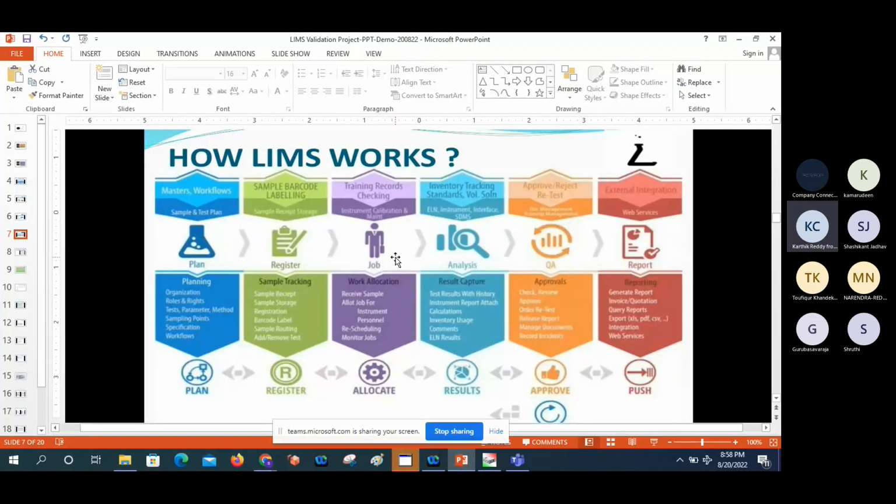Next, external integration through web services report. Different systems can be integrated with the LIMS, like the TrackWise QMS system and the DMS, document management system. If a DMS is not there, the physical copies available in the laboratory need to be verified. We need to see the existing manual data issued by QA, and after that verify the standard test procedures, STP specifications.